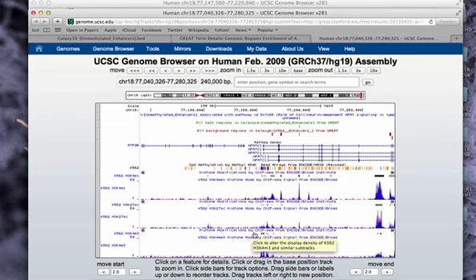And if you had been working previously on the same computer on the UCSC Genome Browser, it will remember all that data, and it will load in custom data for you. So in this case, these are the background regions denoted here in red that we uploaded as K562 enhancers. Here is the test region that we found to be enriched that is not methylated.